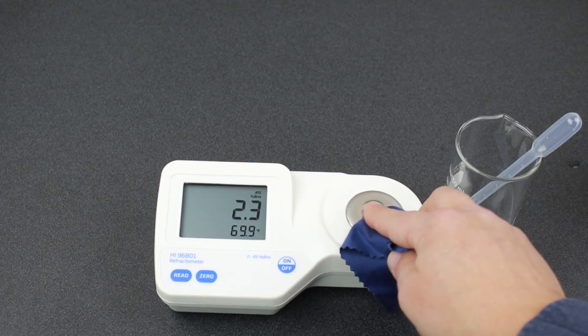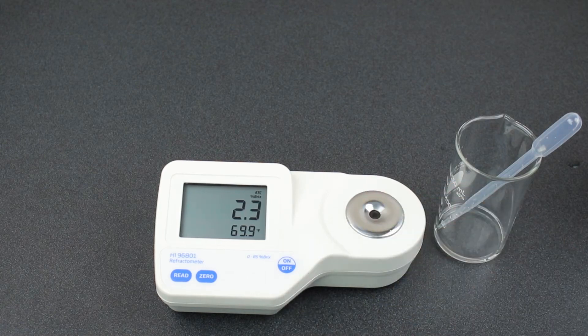That's how easy it is to measure with and care for your maple syrup Brix refractometer. Keep your refractometer stored in a dry place. The sugar house will get cold in the winter, so unless you have an RO room, you should store it elsewhere.